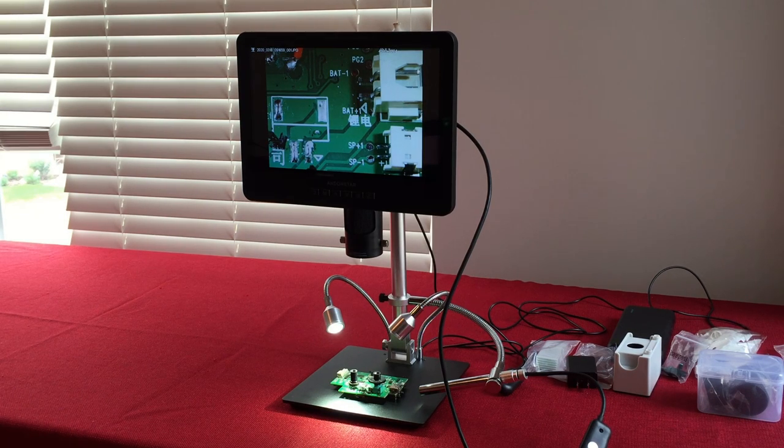This was a basic overview of what the Ennstar can do. Price is around $295, minus the $20 coupon bringing it to $275. There are other models under $200, some $100 to $150. If you're looking for one, use the links below. It's a really cool device — quite a bit of value for your money.